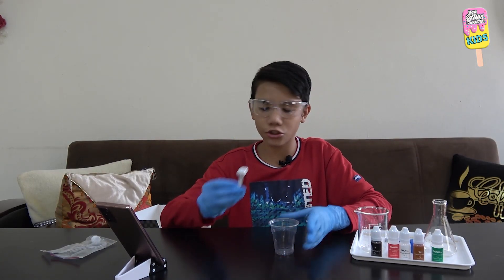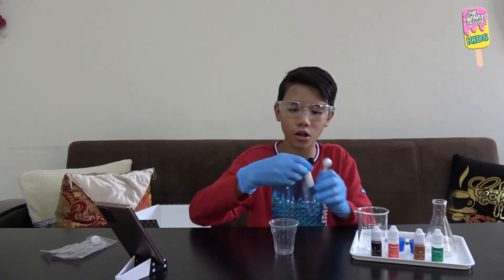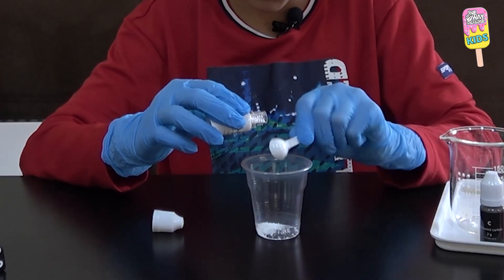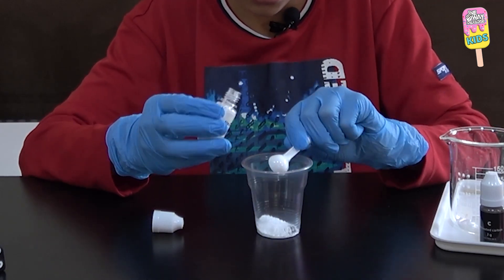Let me put on my gloves. My first step is to measure three big spoonfuls of sodium carbonate into a plastic disposable cup — one, two, and three.